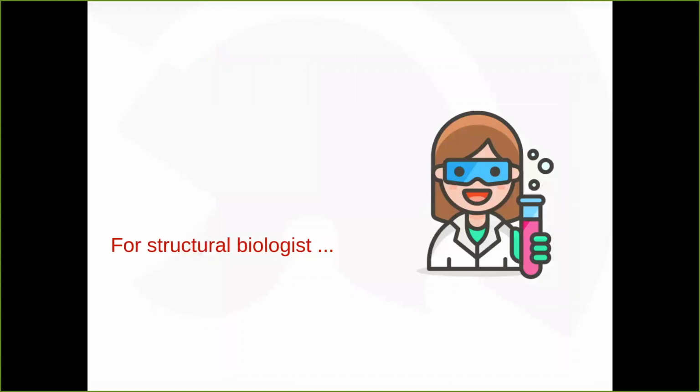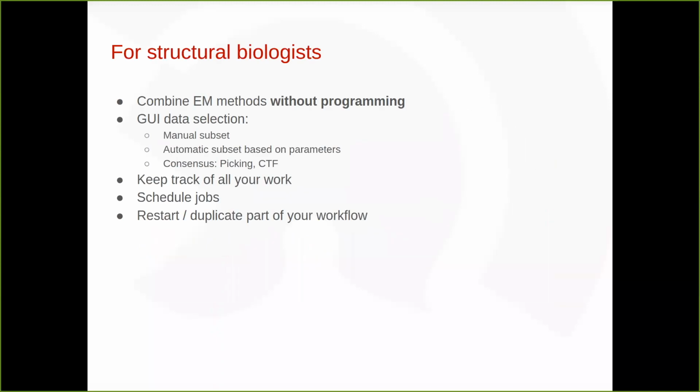So at this point, I'm going to talk about Scipion from the structural biologist's point of view. As I mentioned, you can combine any EM methods without programming, just using the graphical user interface. You can do data selection without running any script. You can select your elements, your particles, manually, and you can create subsets easily. Or you can even automatically create subsets using protocols to filter or prune your data.